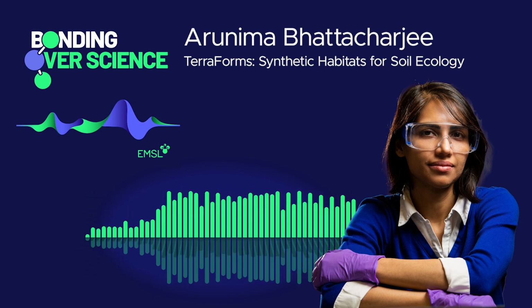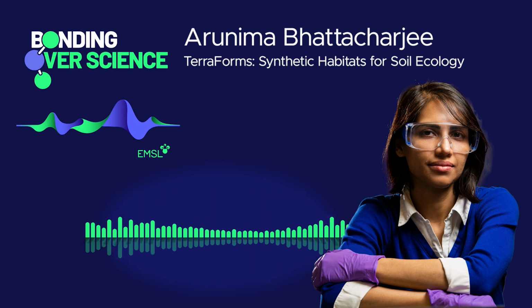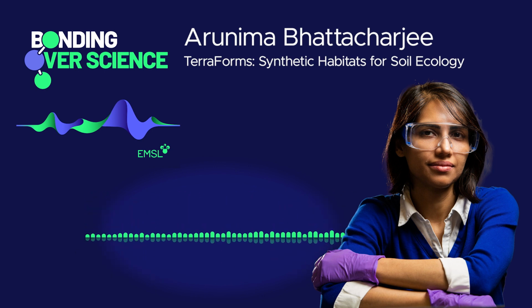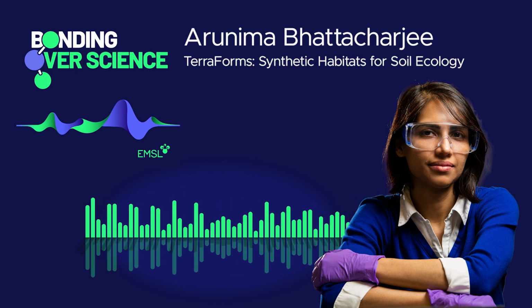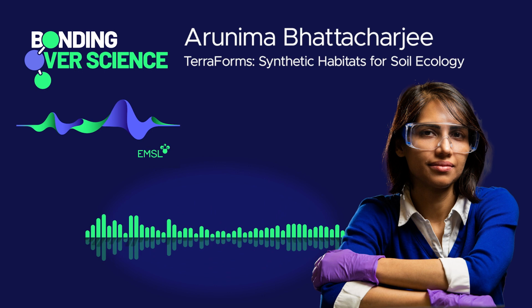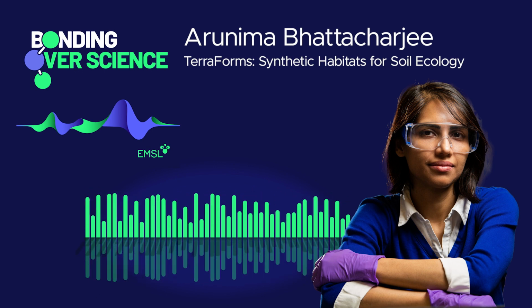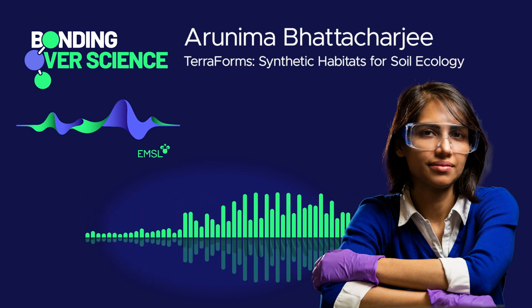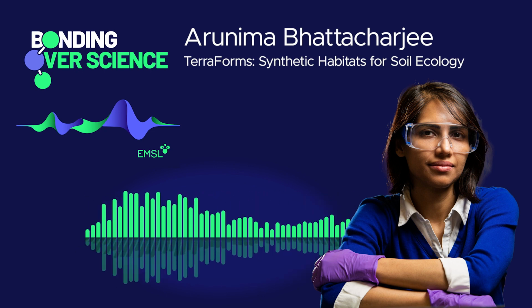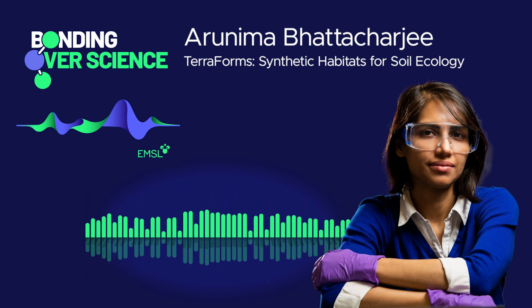One of the projects that was coming in, I'm not sure if it is funded yet, requested this particular platform to look at plant, bacteria, and fungi interaction and how minerals are uptaken by fungi or bacteria and transferred to the plant, for example. So yeah, that's the whole process. And once the incubation is done, the chip is lyophilized and prepped for mass spec. But while the growth is occurring, it can be imaged by microscopy to track growth.